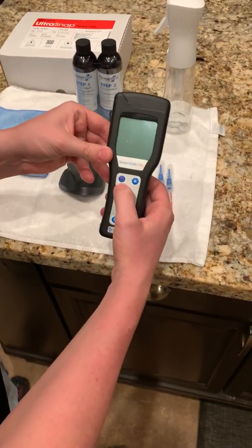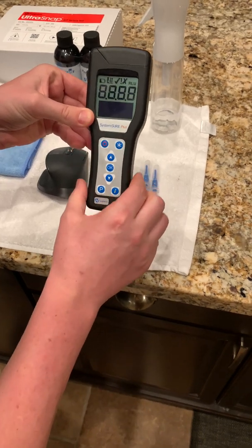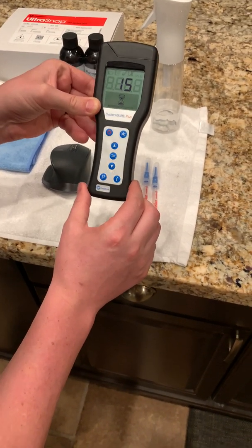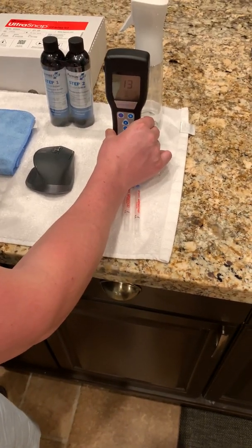First things first, I'm going to turn the ATP luminometer on. It self-calibrates itself. It'll do a 15 second countdown. I'll just leave that here while it does it.